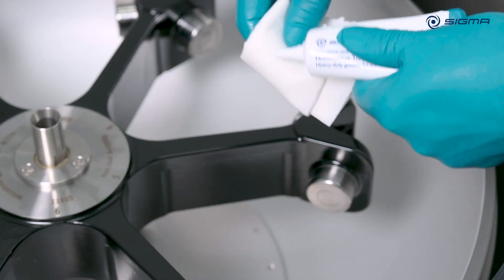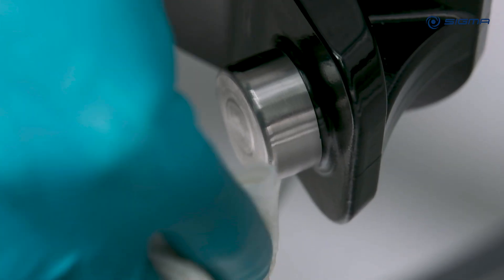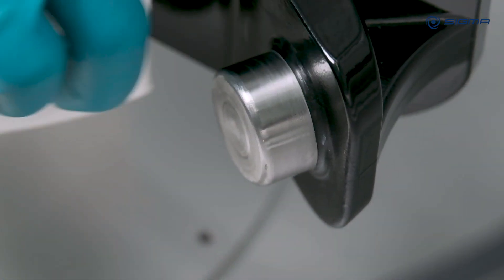For rotors without comfort coating, the rotor pins must be greased with a small amount of pin grease. For rotors with black pins and comfort coating, greasing the pins is not necessary.